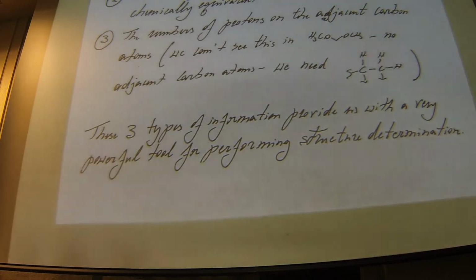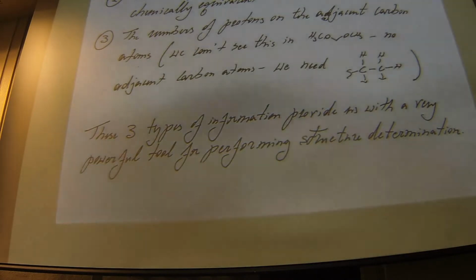Notice that this is very different from any of the other spectroscopies that we've seen so far. UV just tells you about the conjugated double bonds in the system. It doesn't tell you much at all. IR tells you about functional groups. Mass spec, not spectroscopy, I know, tells you molecular weight and fragments. It gives you a lot of information, but not detailed like this. So this gives you the real information. It's almost like a photograph of the molecule.